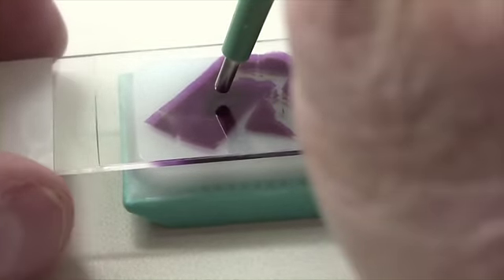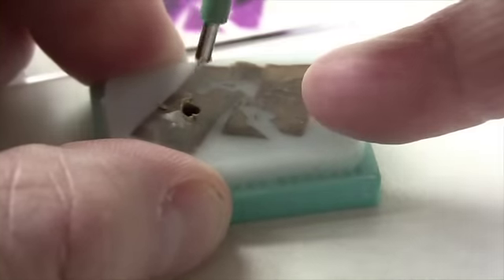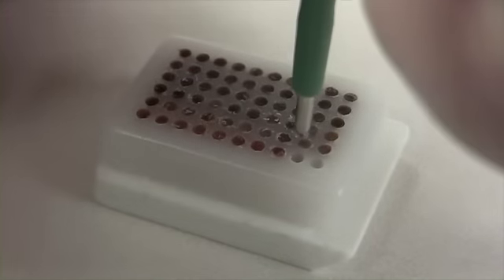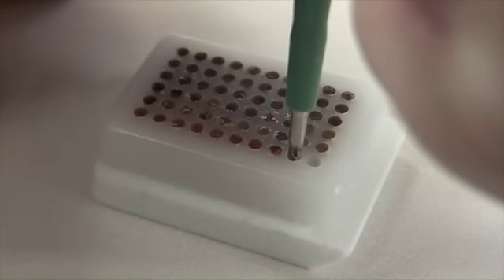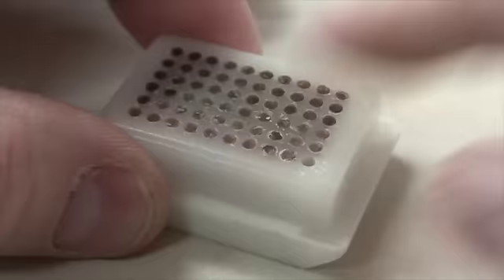When you do your TMA, make sure your array block is at room temperature. This will also reduce the chance of cracking. You may flatten the punches from time to time, either by pressing a glass slide on the top or flipping the block over and pressing it gently on the surface of a countertop.